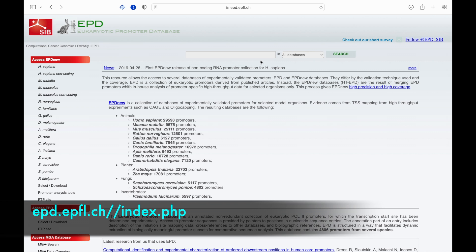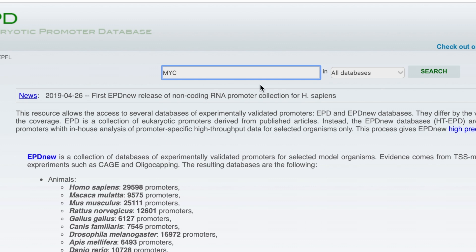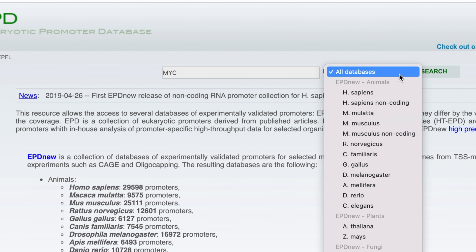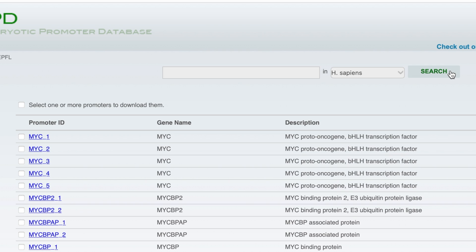First, let us retrieve the CMYC promoter sequence from the eukaryotic promoter database by logging into the website as shown on the screen. In the search bar, type in MYC and select the first option. In the species search bar, type in Homo sapiens and click search. Select the first promoter ID.